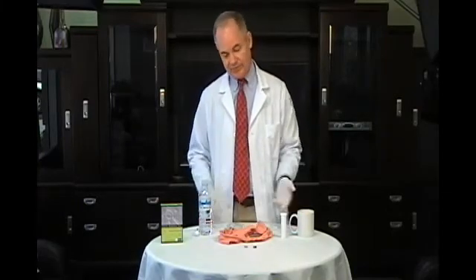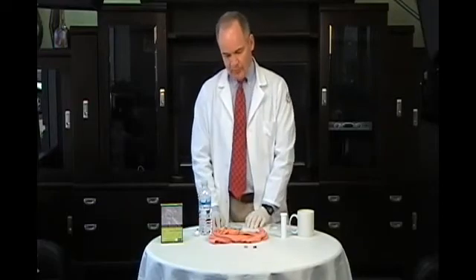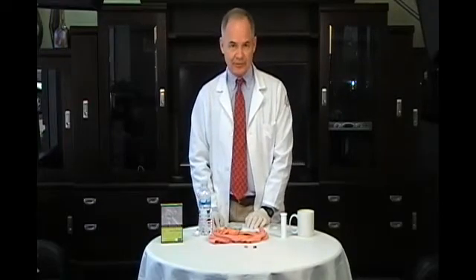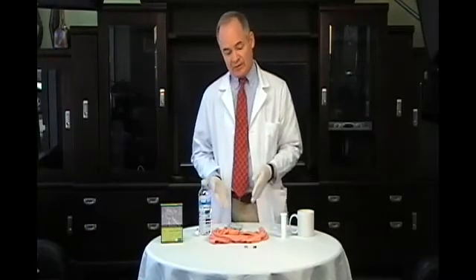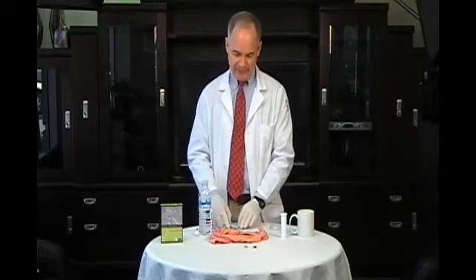Actually, it's a little simpler just to put the strip directly on the underwear. Now, this is a presumptive test for semen. Doesn't mean it is semen, doesn't prove it is. In order to do that, we have to follow this test up with a second test. And this test is for prostate-specific antigen.